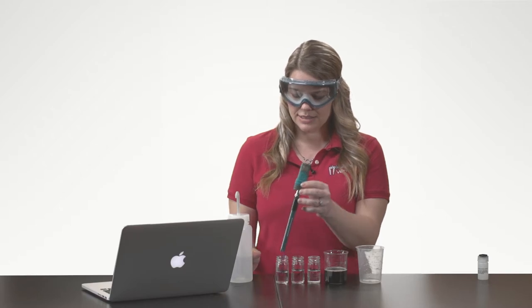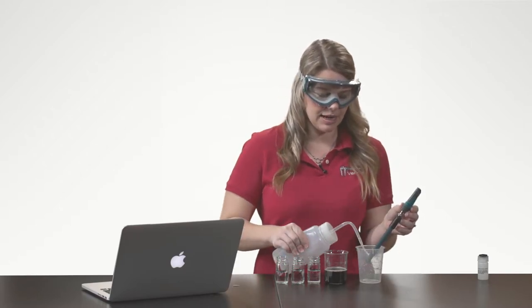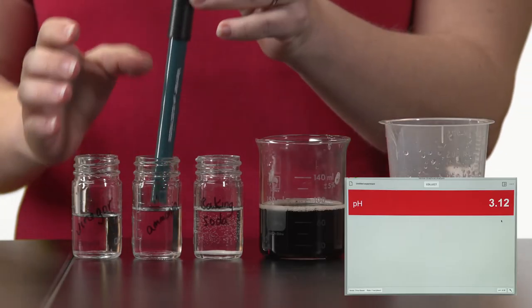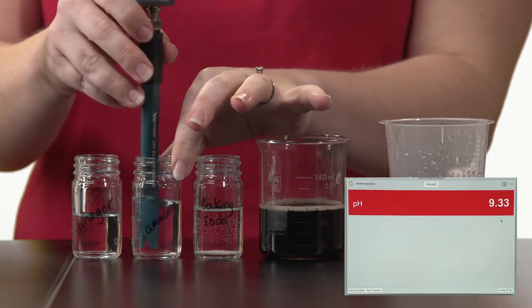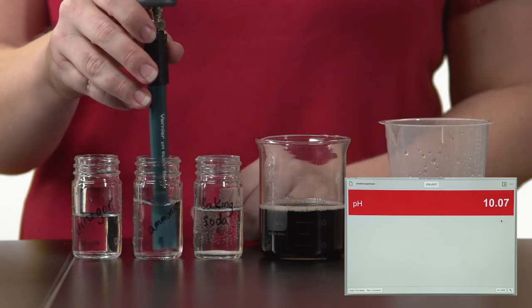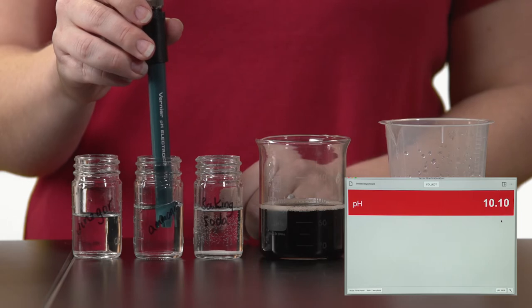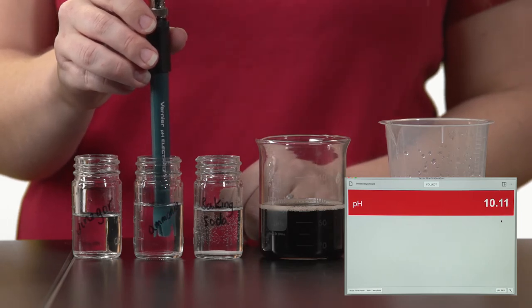To switch to my next solution, I need to rinse the tip again. And then I will measure ammonia. That solution is definitely basic, so I will record that pH reading in my lab notebook.